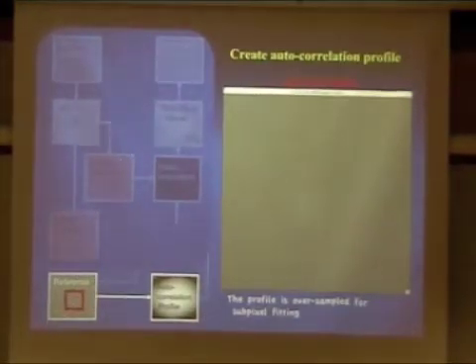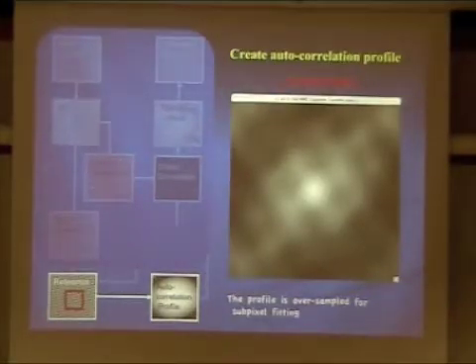Now, what we need to do is search on that to find out the distortion. We need to know the shape of those cross correlation peaks in order to do a good search. So we take the reference area, and when you do an autocorrelation on it, it looks something like this, because we have it oversampled so that you can look at the subpixel shift.